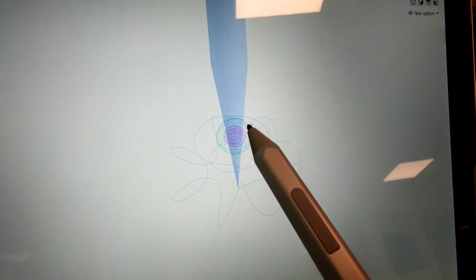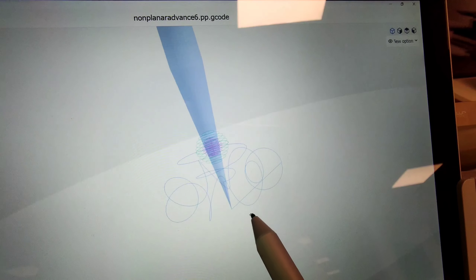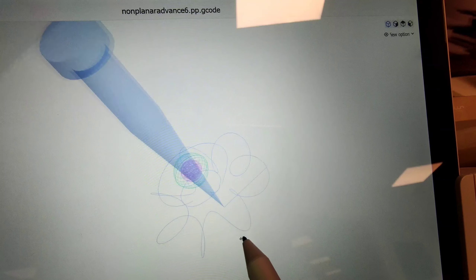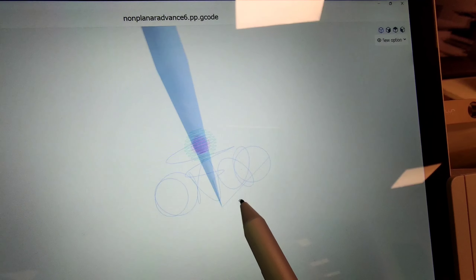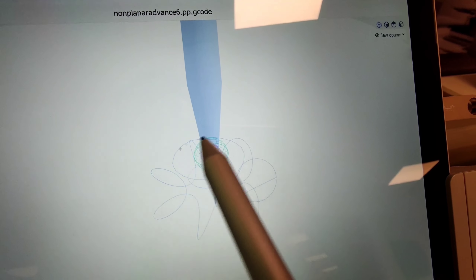So this is the model — it's a sort of flower, surrounding the vascular tissue. This is the organoid in green and pink, and the non-planar vascular tissue is surrounding that. It's destroyed, and it's an ellipse.